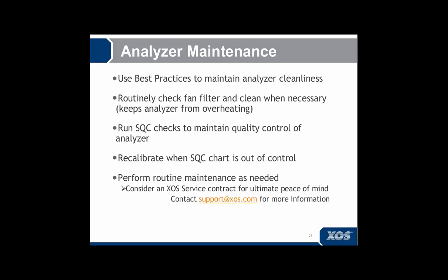Of course, you're also going to run SQC checks so that you can maintain statistical quality control of your analyzer. And then you'll recalibrate your analyzer when your SQC chart is out of control. Additionally, you want to perform routine maintenance.